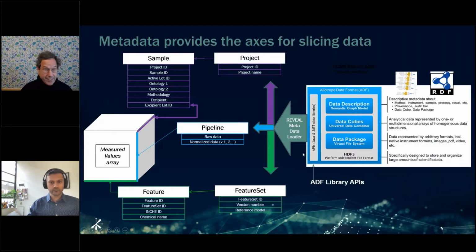So with regard to the metadata, it's an interesting challenge, and I think Wolfgang said something really smart in that last session, among many things, but one thing in particular, which is that for a particular analysis project, you'll really only need a subset of the metadata in order to construct an analysis query. And what we're showing here is simply how you might organize some of the metadata that's in the ADF file into a logical hierarchy of arrays.